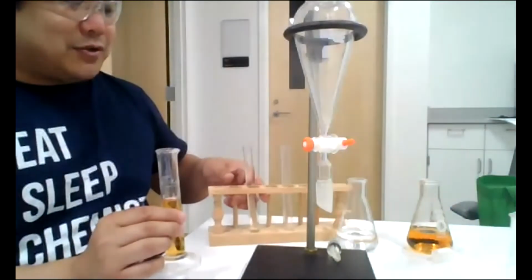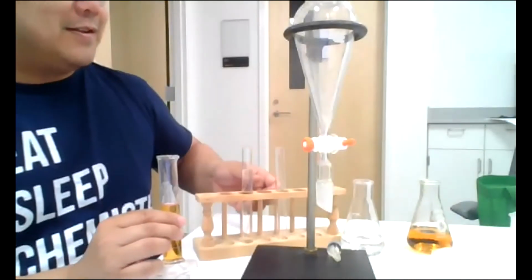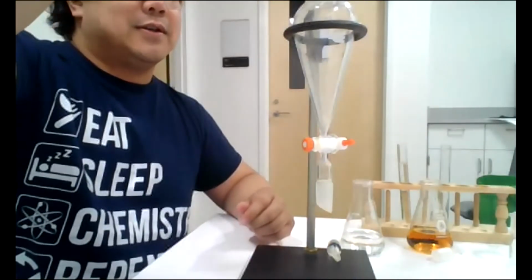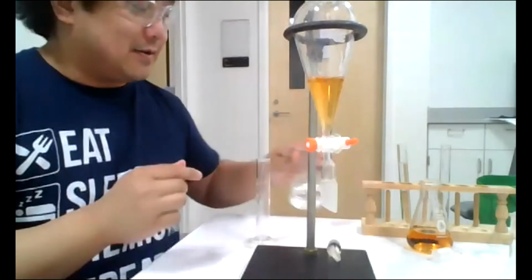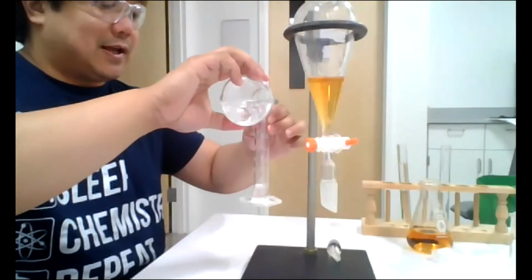someone noticed that, well, 25 milliliters isn't going to fit into our test tube. So they switched it up and said 20 milliliters, and that's what we're using. So here's 20 milliliters of iodine, and we're going to do 10 and 10, okay? But not at the same time. So here's 10 milliliters of cyclohexane.